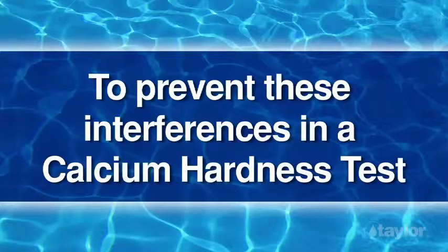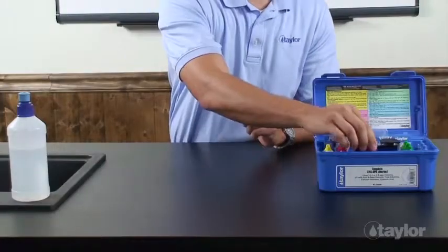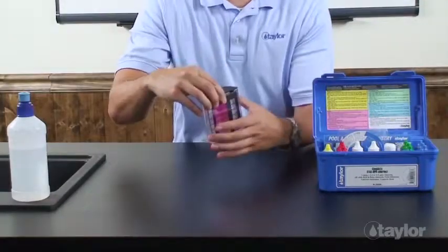To prevent these interferences in a calcium hardness test, add additional reagent 12 at the beginning of the test.